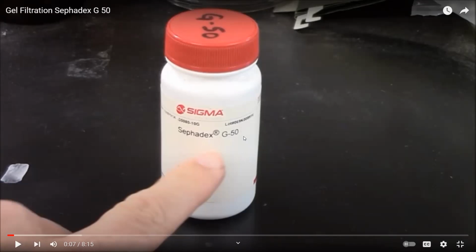So G50, now this 50 determines the pore size. The size of the analyte that you are going to separate will decide what type of gel you are going to use.